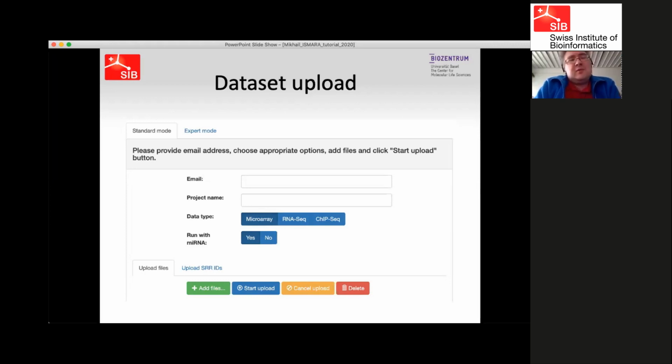Project name could also be quite useful because when you open results, it is shown at the top left. If you have results from multiple datasets you want to compare, and you start to switch between browser tabs, an identifier of a dataset could be quite important, so you can easily distinguish between the different datasets. Also, in case of problems, it will be quite easy for us to find the dataset just by the project name if you submitted it with one.